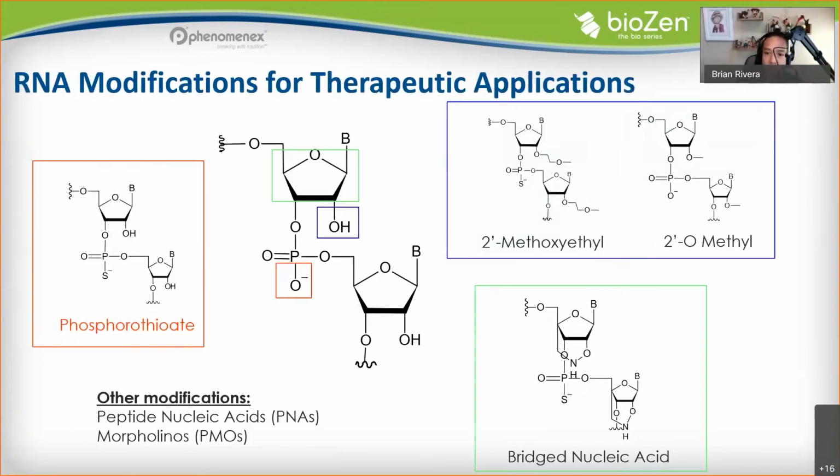So some discussions on the different modifications of oligos and really how they pertain to chromatography. The most critical of the modifications, of course, as was mentioned before, is the non-bridging oxygen phosphodiester backbone, the sulfur group that's associated to that in the phosphorothioate. So the so-called PS chemistry, that really is to minimize the hydrolysis by endo and exonuclease, and that, of course, confers stability. It is important, of course, that it does lead to introductions in diastereomers.